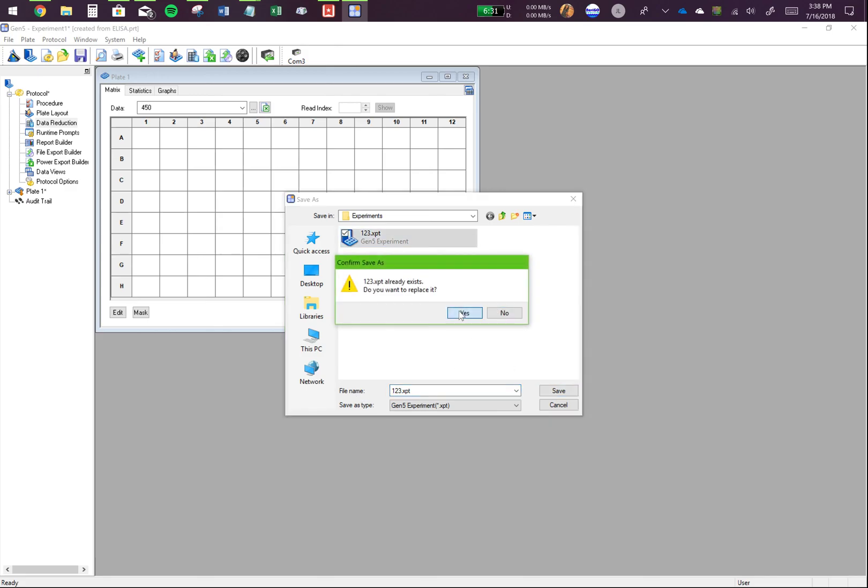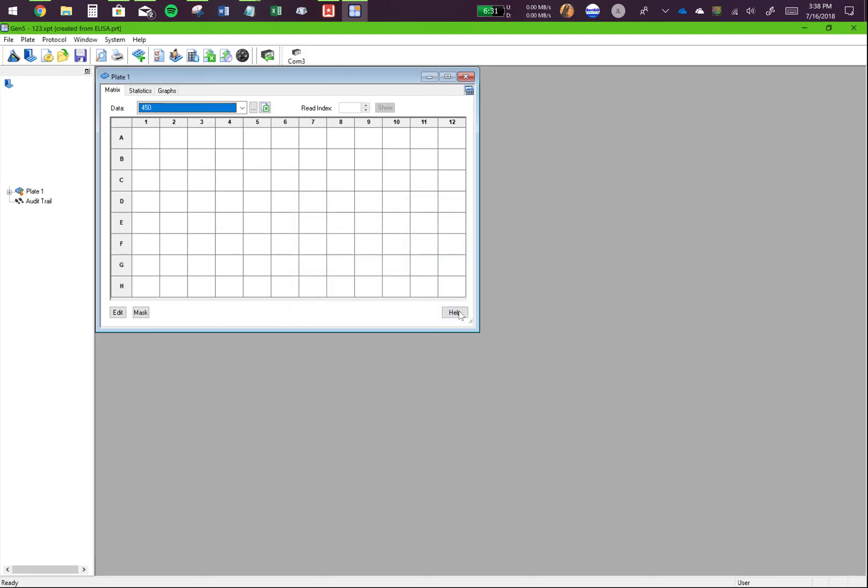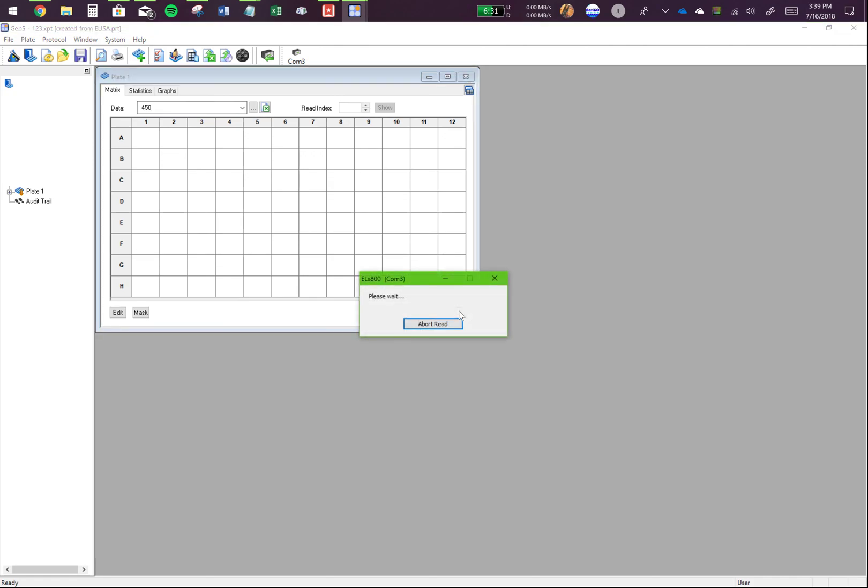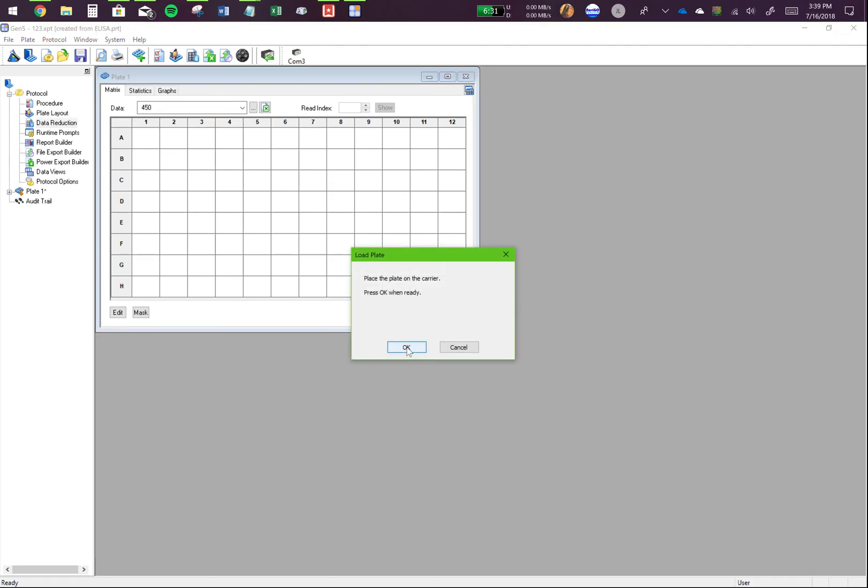I'll just replace this right now. At this point, you are done. You just have to wait for, click OK and wait for the spectrometer to give you the result. And that's how you make a standard curve using Gen5. Thank you.